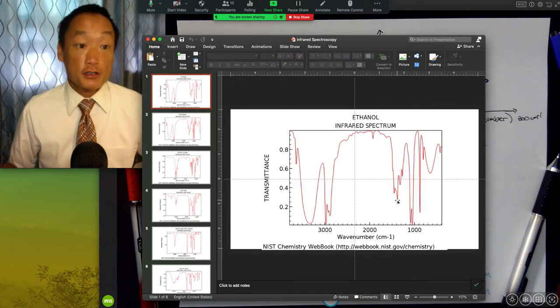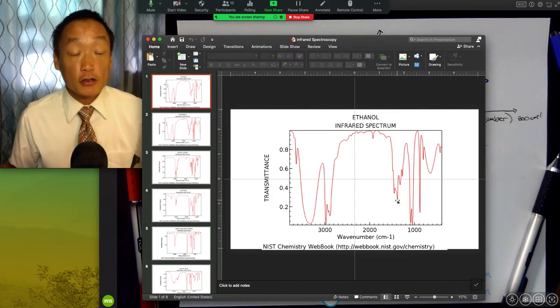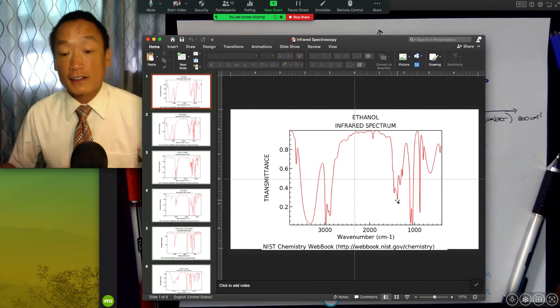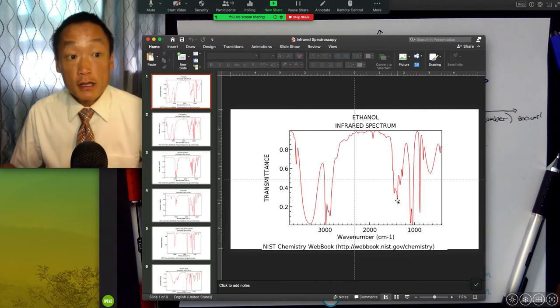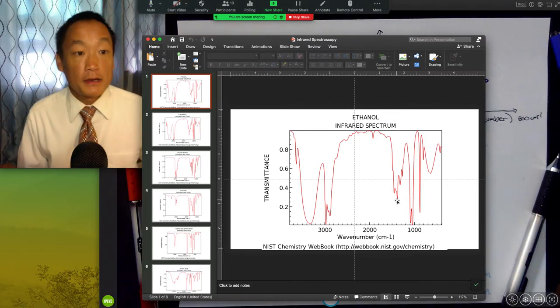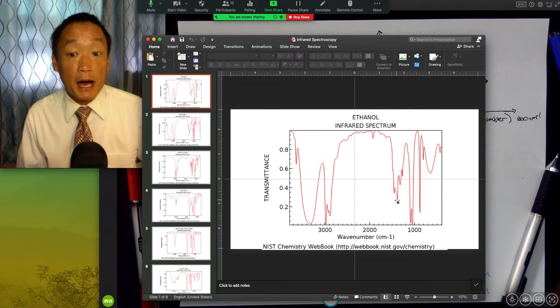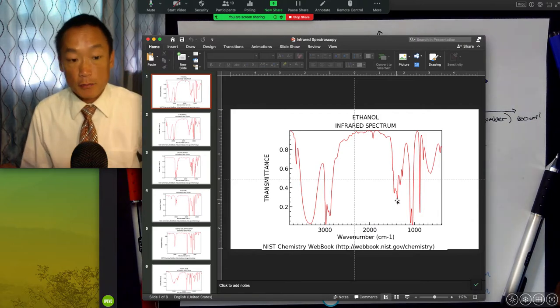at that point in time, there is a bond that is partially excited by that wavelength of light. And when it's partially excited, some of that light is translated into molecular motion, while other aspects of that light are not translated into molecular motion. It passes through the sample. Maybe 40% of it does. I think, well, not even maybe, we're looking at 30% of that light is not absorbed by the molecule. It passes through that sample, goes through the slit, hits the prism, gets deflected, hits the detector, and then shows up at that position in our spectrum after Fourier transformation.